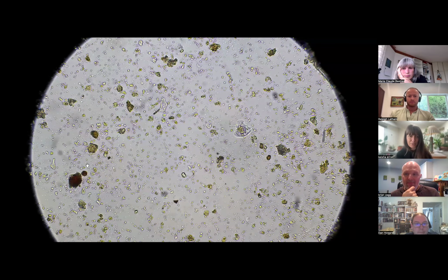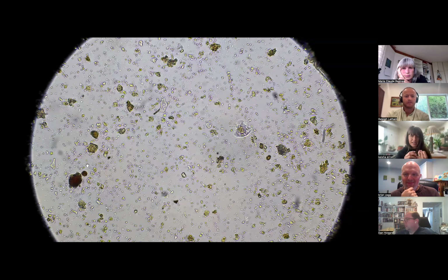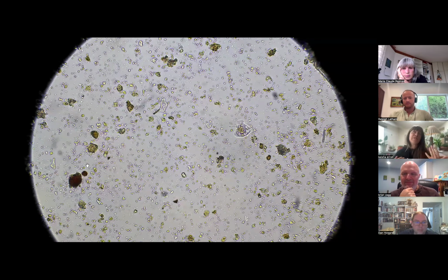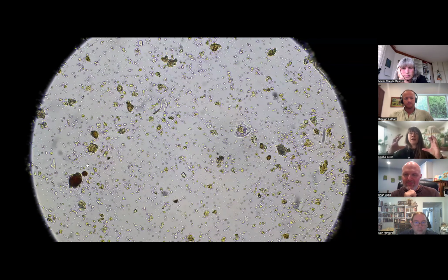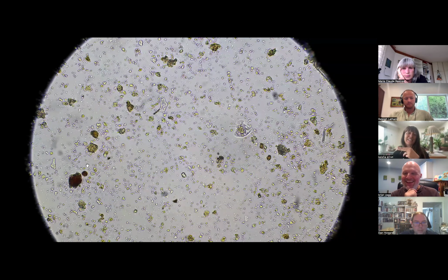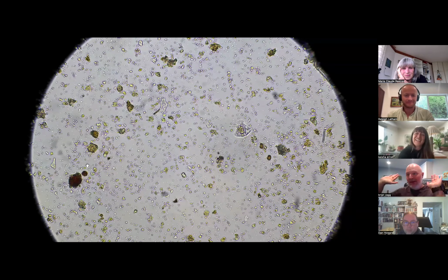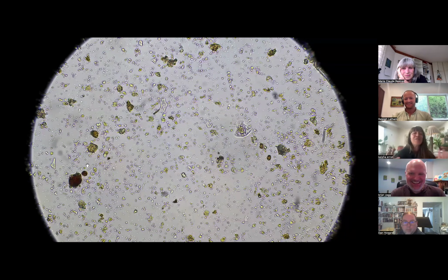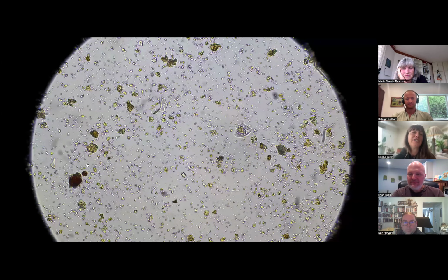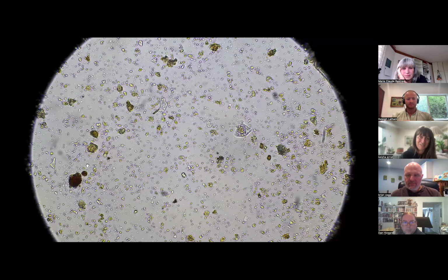Now, your other sample, in the few times you moved it, I saw a giant testate amoeba, I saw aggregation, lots of colors, many fungal hyphae, even some clear and colorless hyphae. I actually saw that flagellate come in, and then I giggled because it just left. It was like, no, thank you, I'm out. With barely moving around, and these are both aerobic samples, we can see really clearly that there was a lot more diversity in that first sample than this second one, right?